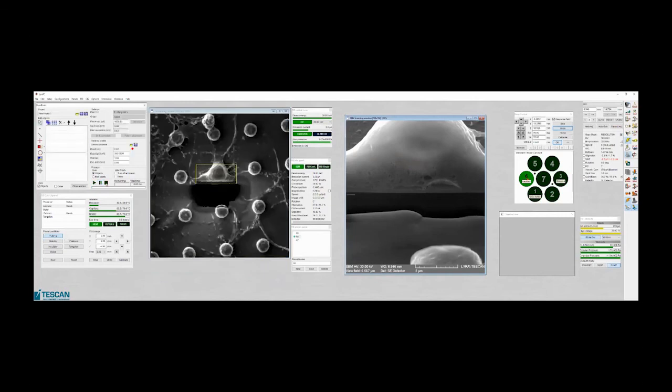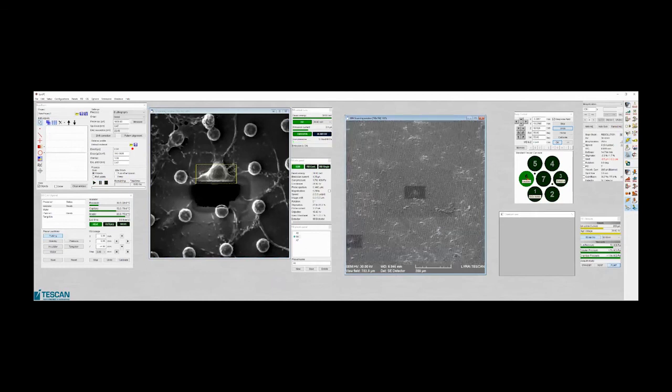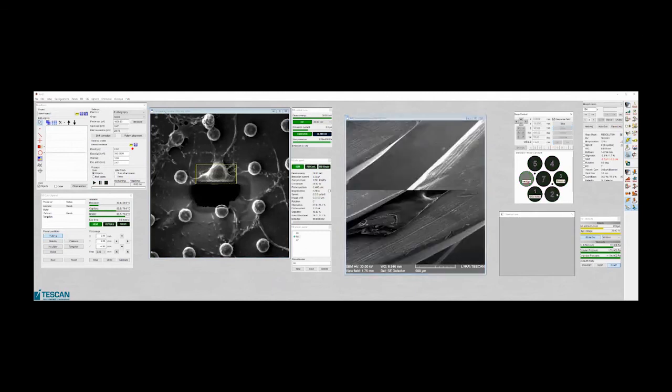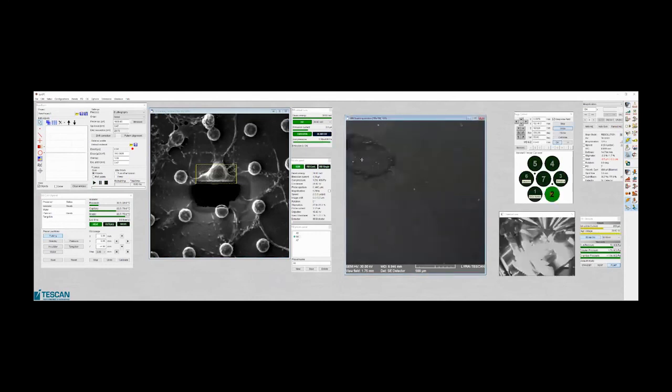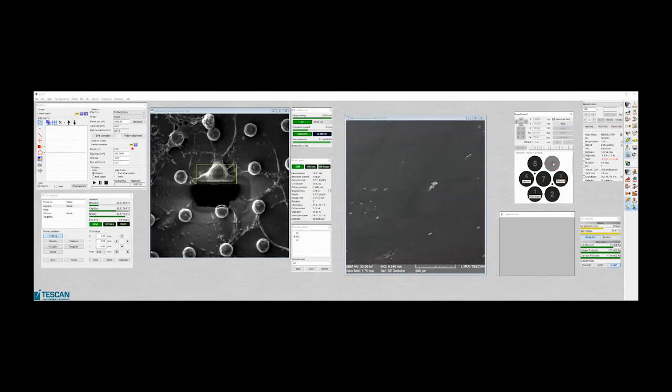So that was this tomography. Do I have any other samples there? I have tissues. Not this one. Oh yeah, it was a chip.